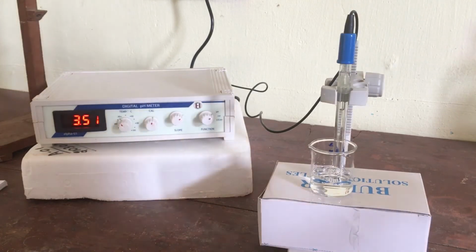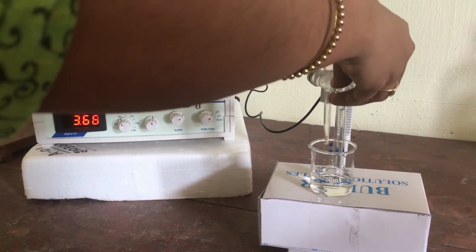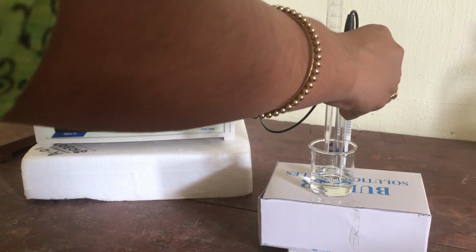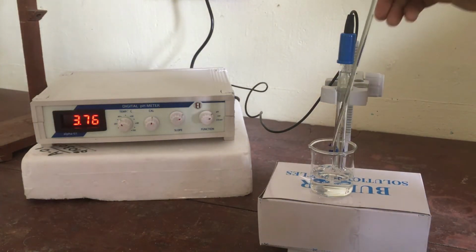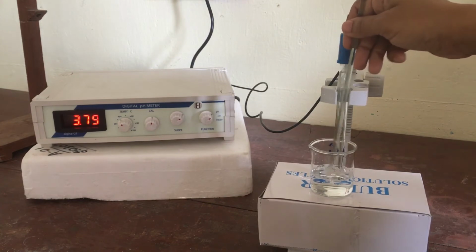We need to continue the same process repeatedly until we get a sudden shoot up in the pH value along with the end point. Till that time we need to continue adding NaOH, stirring, and noting the value of pH.